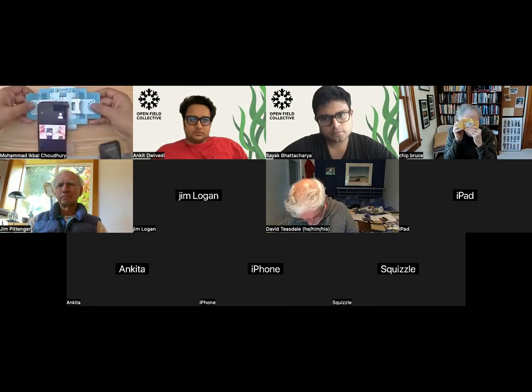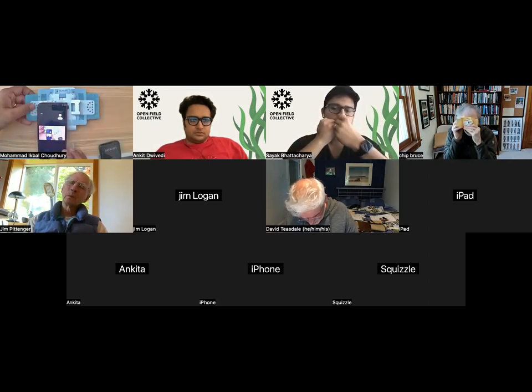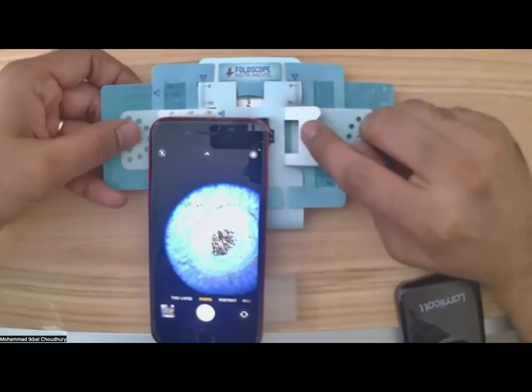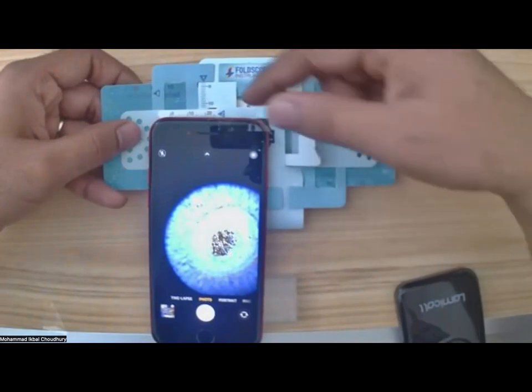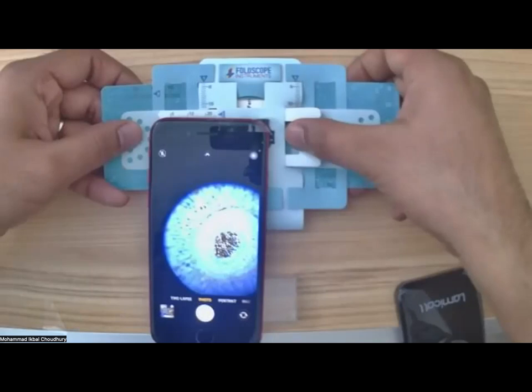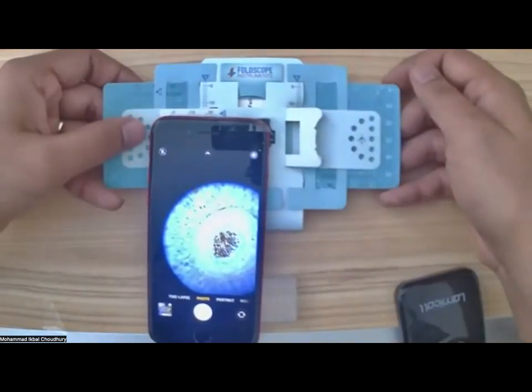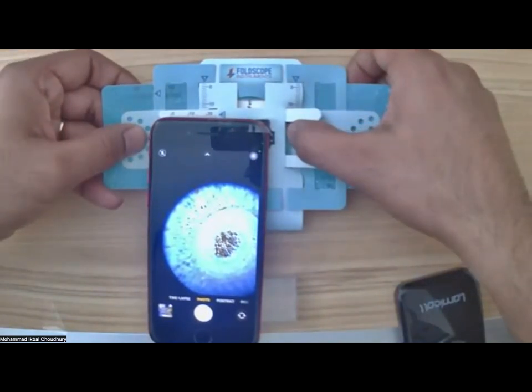So you hold the microscope like that with your thumb. You can do the XY. Now that I have already positioned my sample right at the center, what I'll do is use this wedge here that is taller on one side and shorter on the other. So I can move this wedge while I have the XY held with my other hand, and now the wedge can move independently.